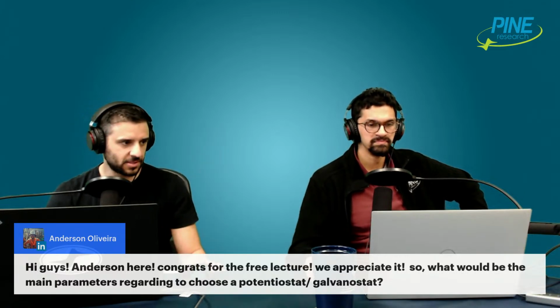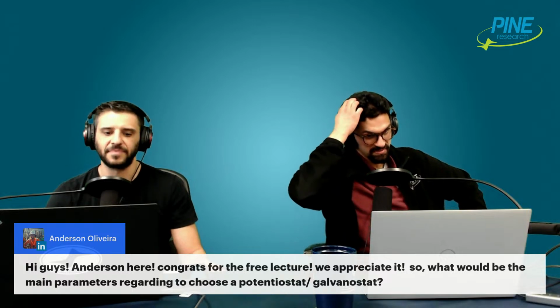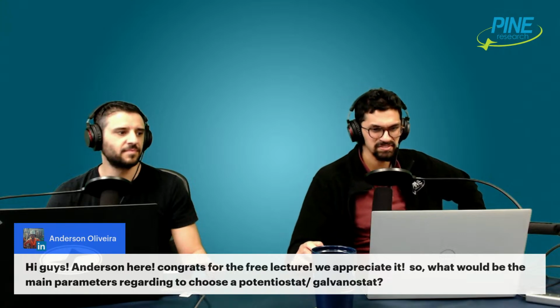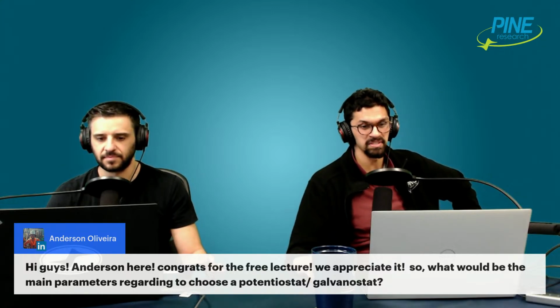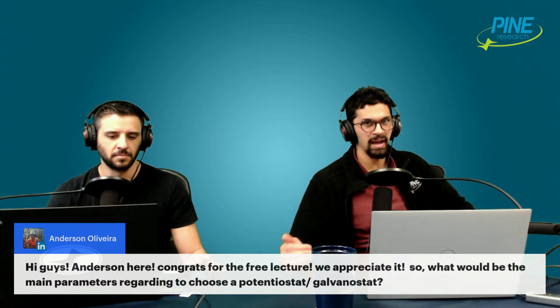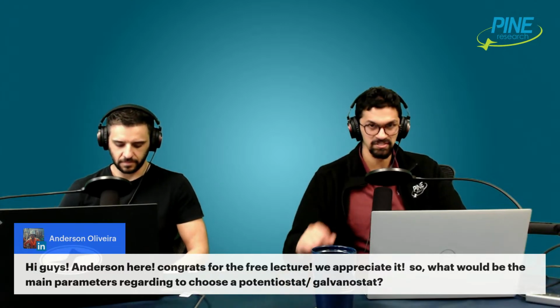Anyway, this is one of the old articles I guess you wrote about choosing a potentiostat a while ago. Yeah, like 2020 or something. Yeah, it's been a while. How to choose a potentiostat. But yeah, that might be helpful. More specifically, it goes into how you interpret the spec sheet on a potentiostat.